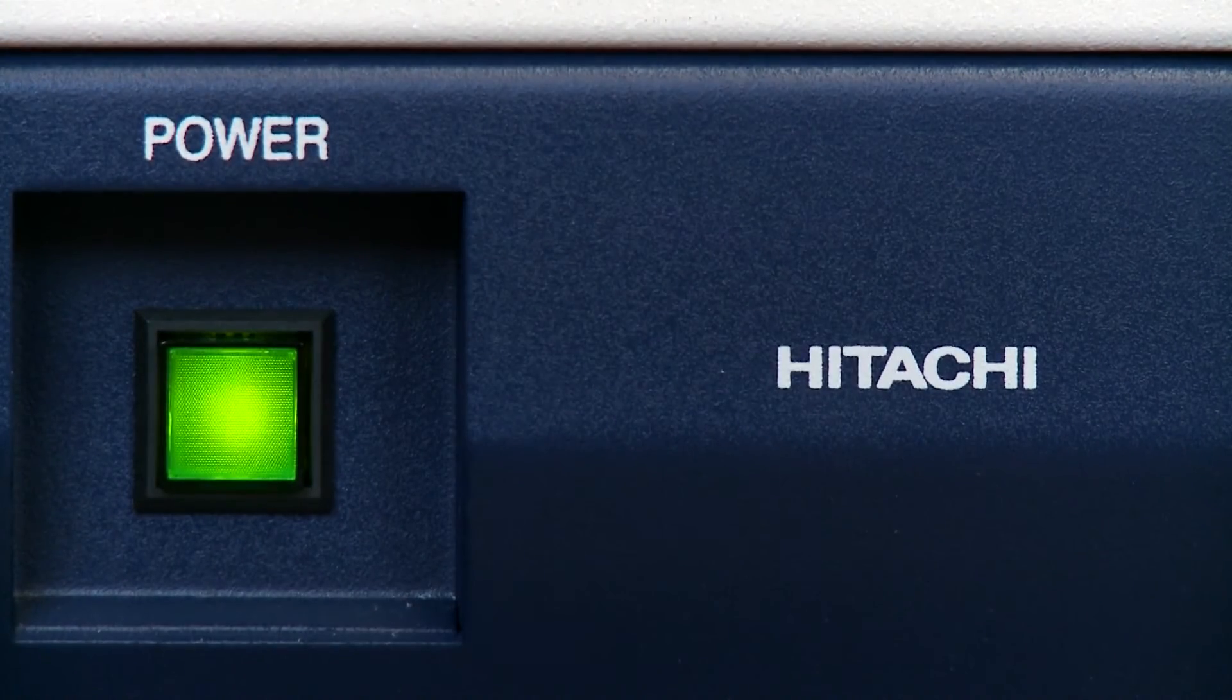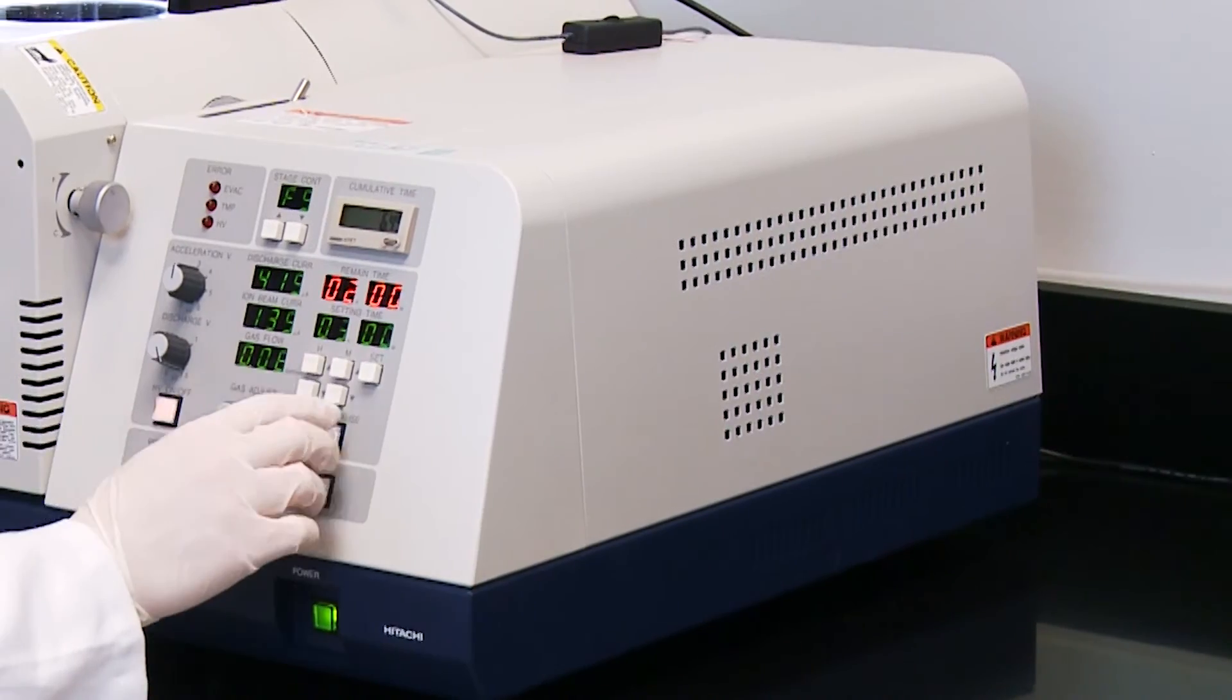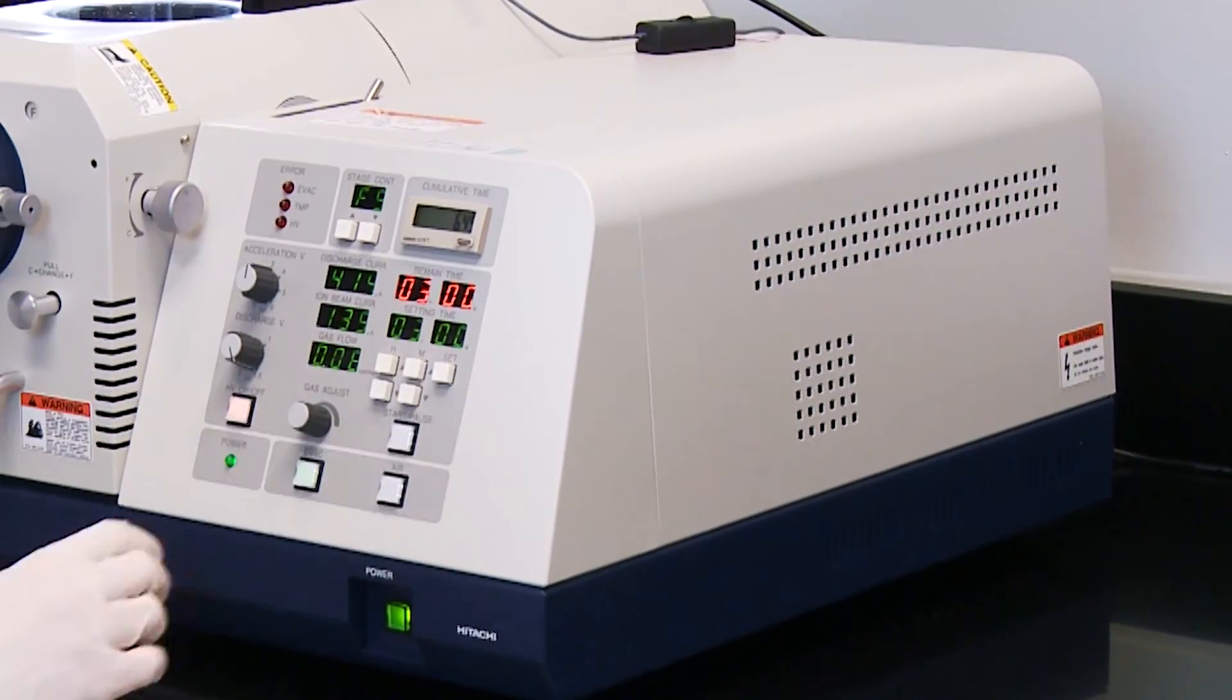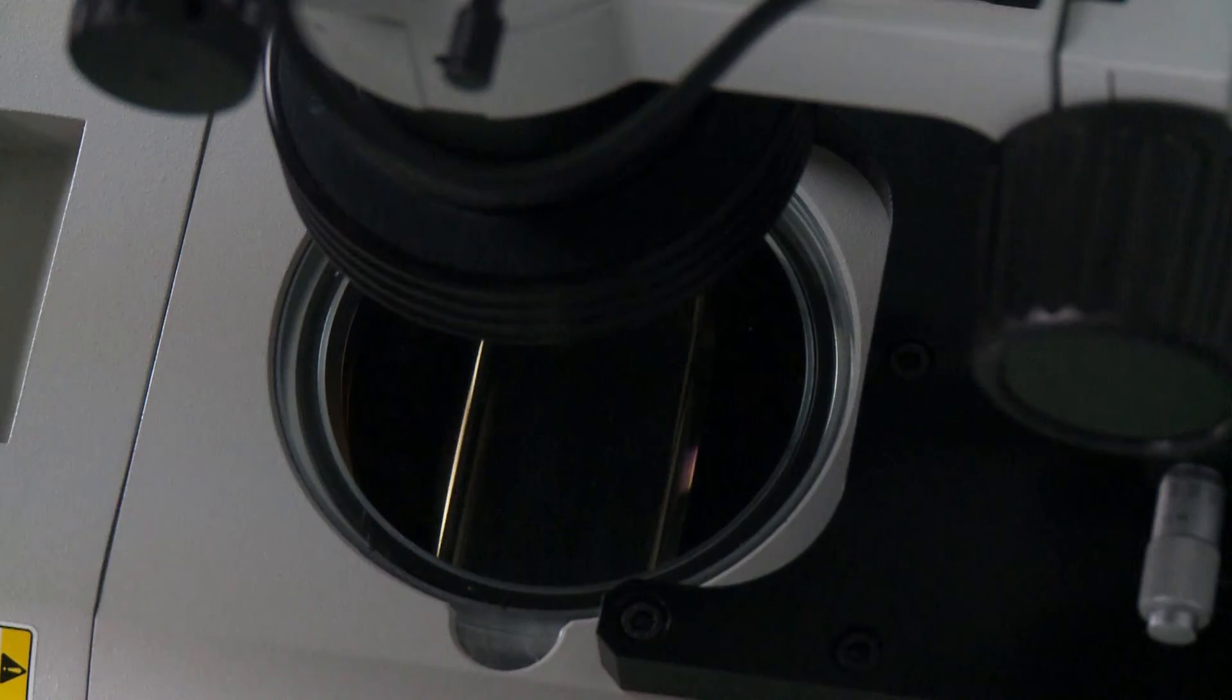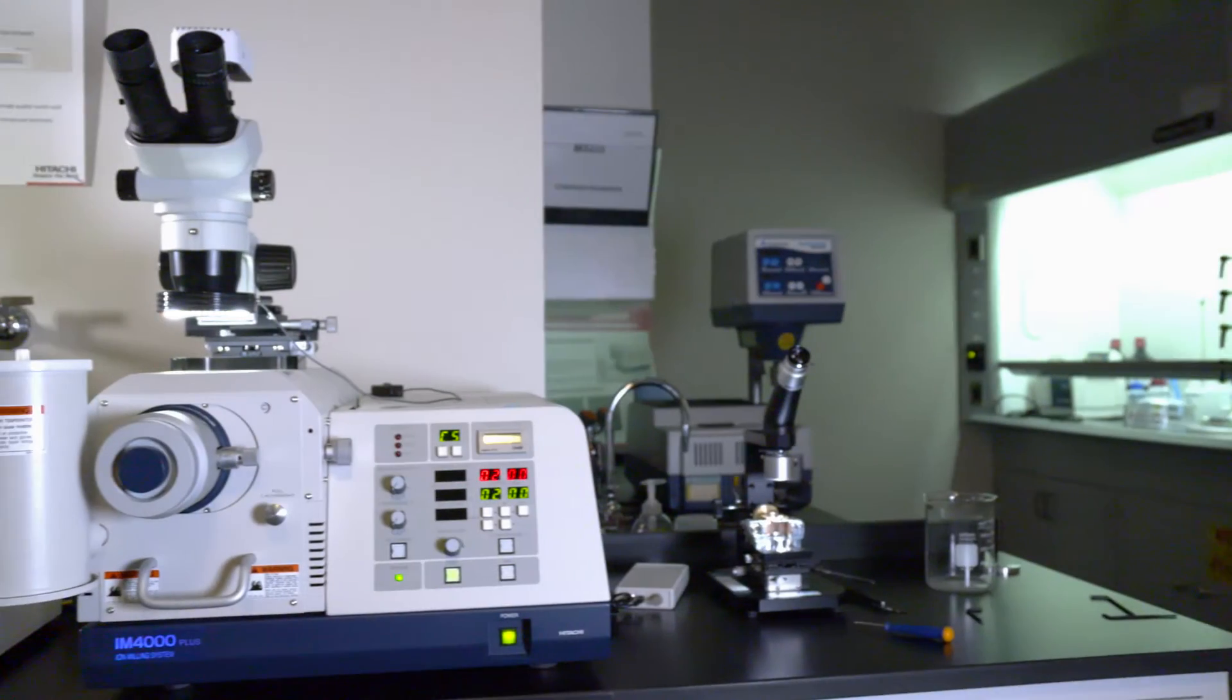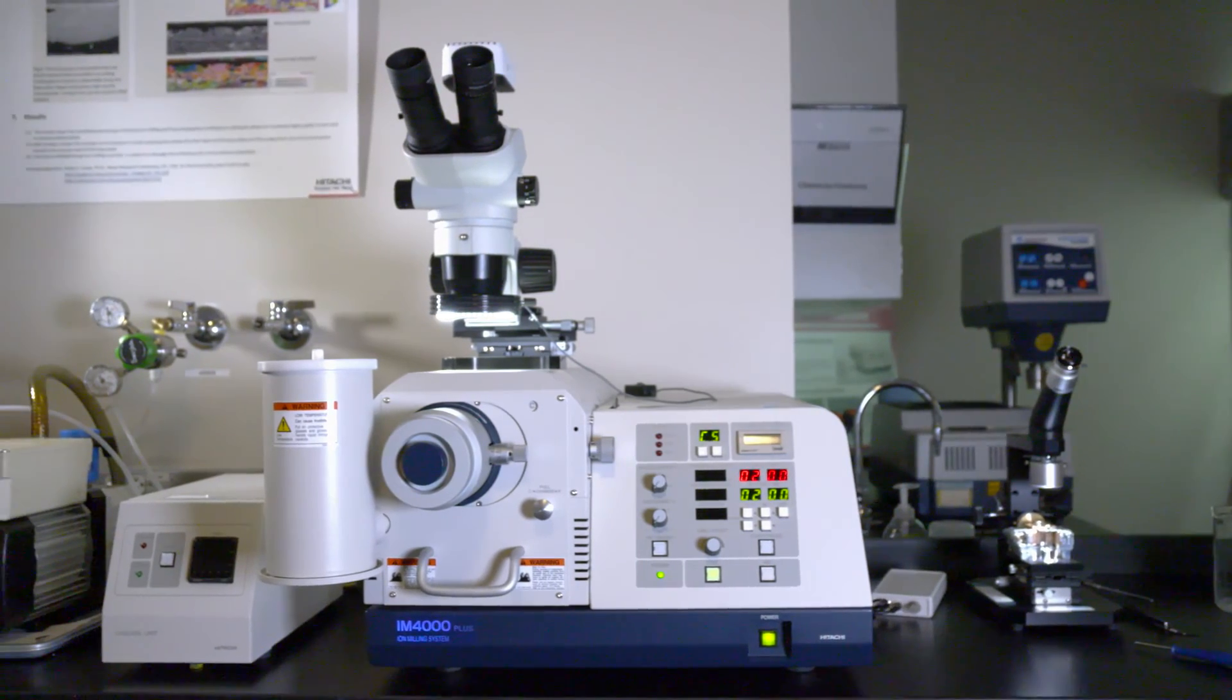The Ion 4000 Plus includes an energy saving automatic shutoff feature. The milling time can be set using the digital countdown display. Milling is complete once the countdown display reaches zero. After an additional 30 minutes of inactivity, the Ion 4000 Plus system shuts down completely. This shutoff feature gives the user the ability to conserve energy and the option to run a milling session while not present.